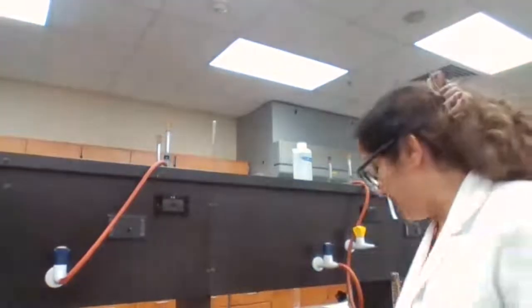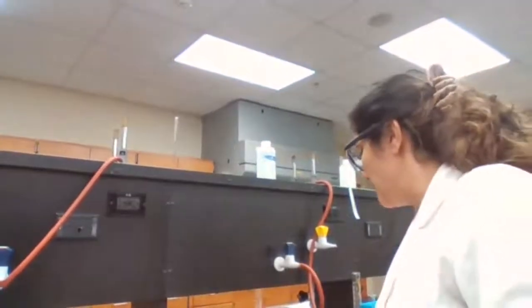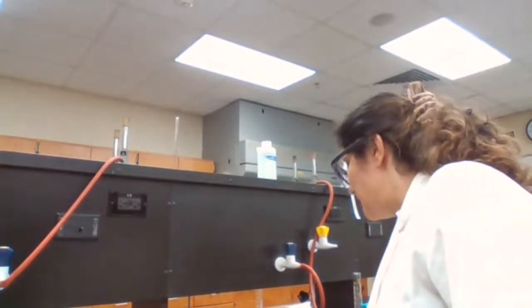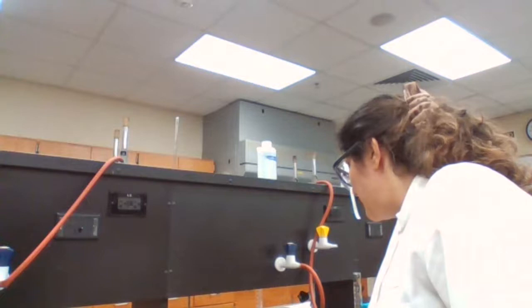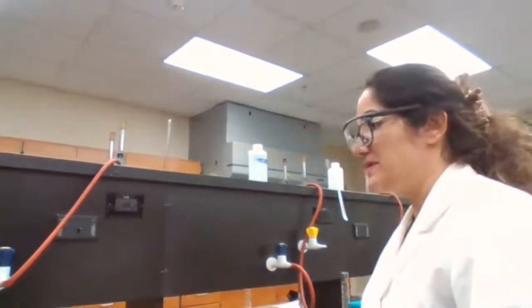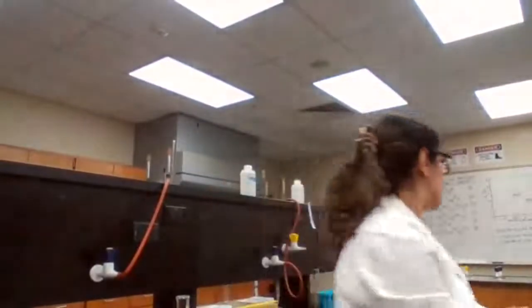And when you read the experiment, then you understand what that 2R means, and you are going to find them. 20 pieces of zinc metal. We find the zinc metal first, and we measure the volume for zinc metal.